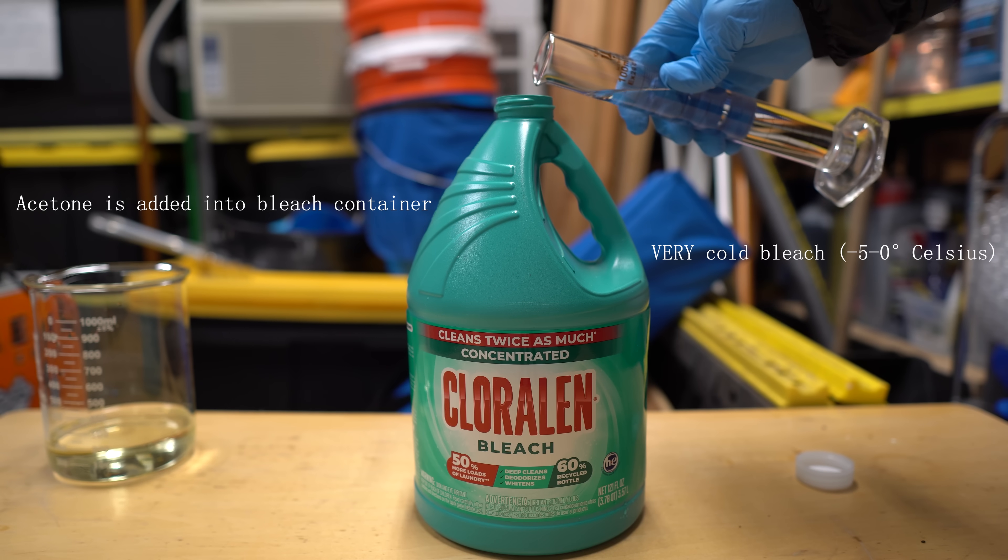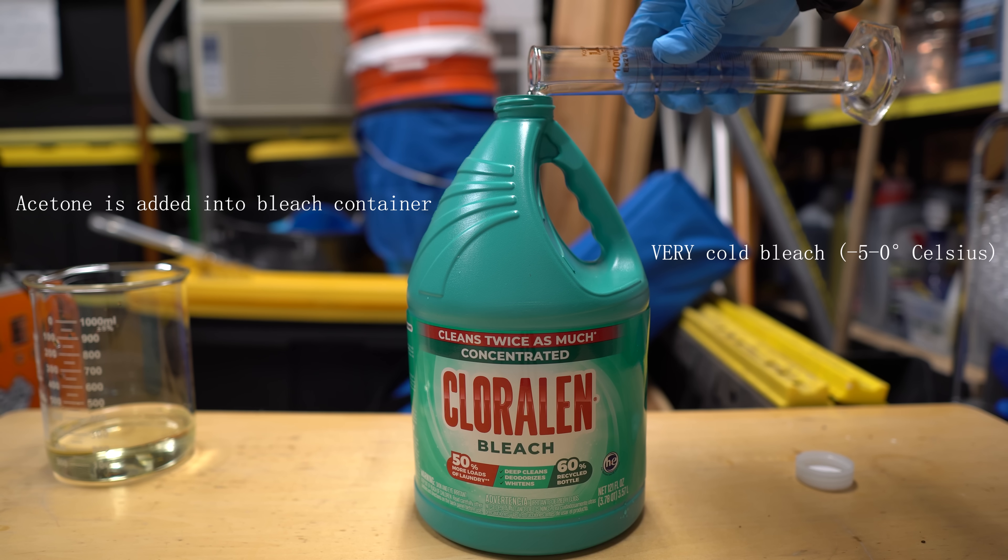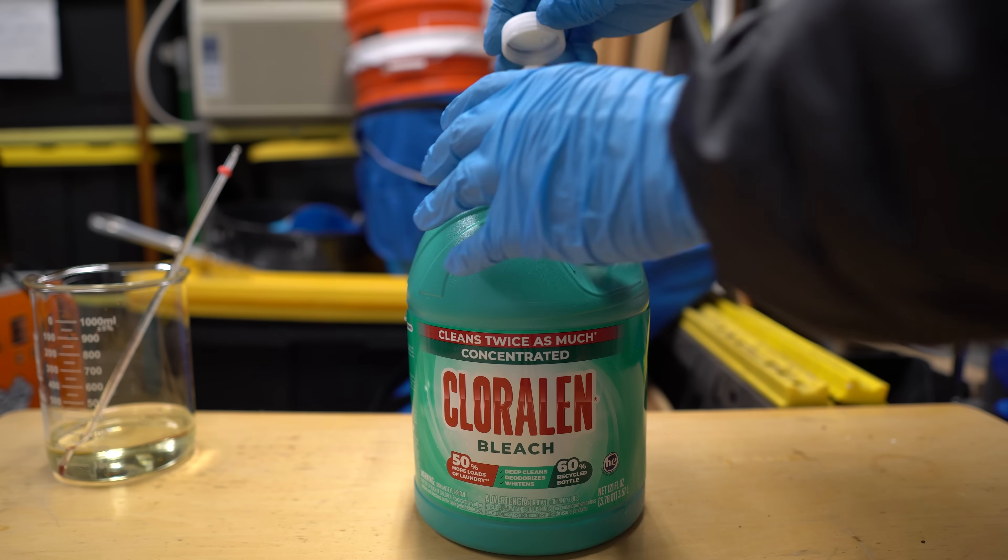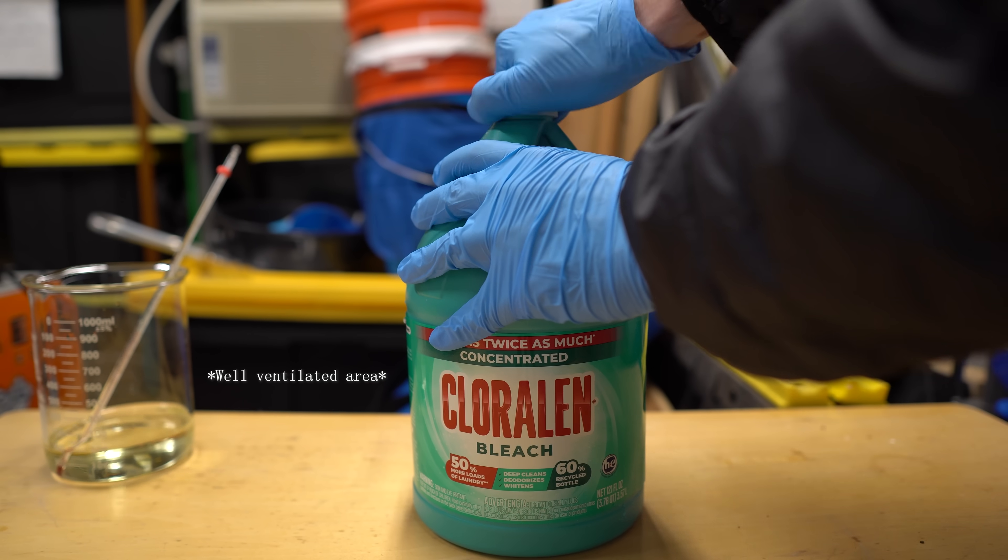Another important thing is you're going to want to chill your bleach to a very low temperature, maybe around negative 5 to 0 degrees Celsius. This is because the reaction between acetone and bleach is very exothermic and it will release a lot of heat. In case you don't understand, heat equals bad. The cap is put on, and everything is shaken around to mix all of the solution together.